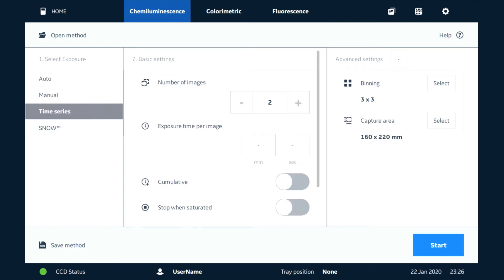We have a time series mode where we can stack our frames on top of each other—that would be in cumulative mode. If you want to see the individual frames, we're going to disengage that and we can see each of those individual frames as they're captured.